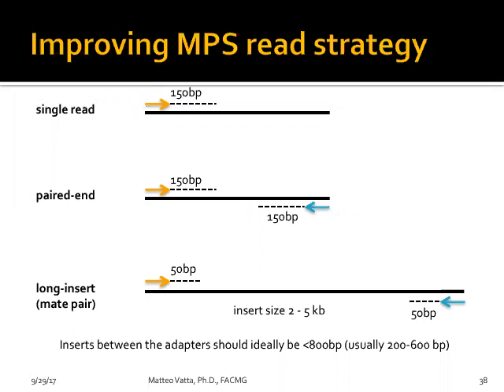So sequences were read only from one direction or the other direction. So we had only a single read analysis, and then the content was produced.